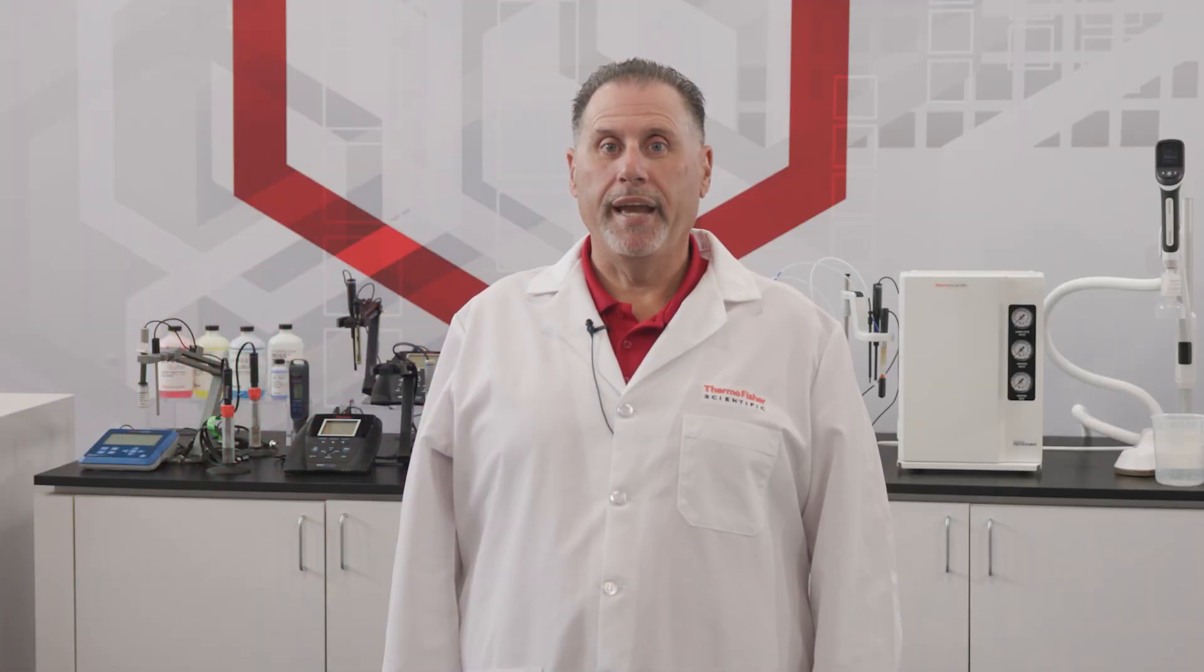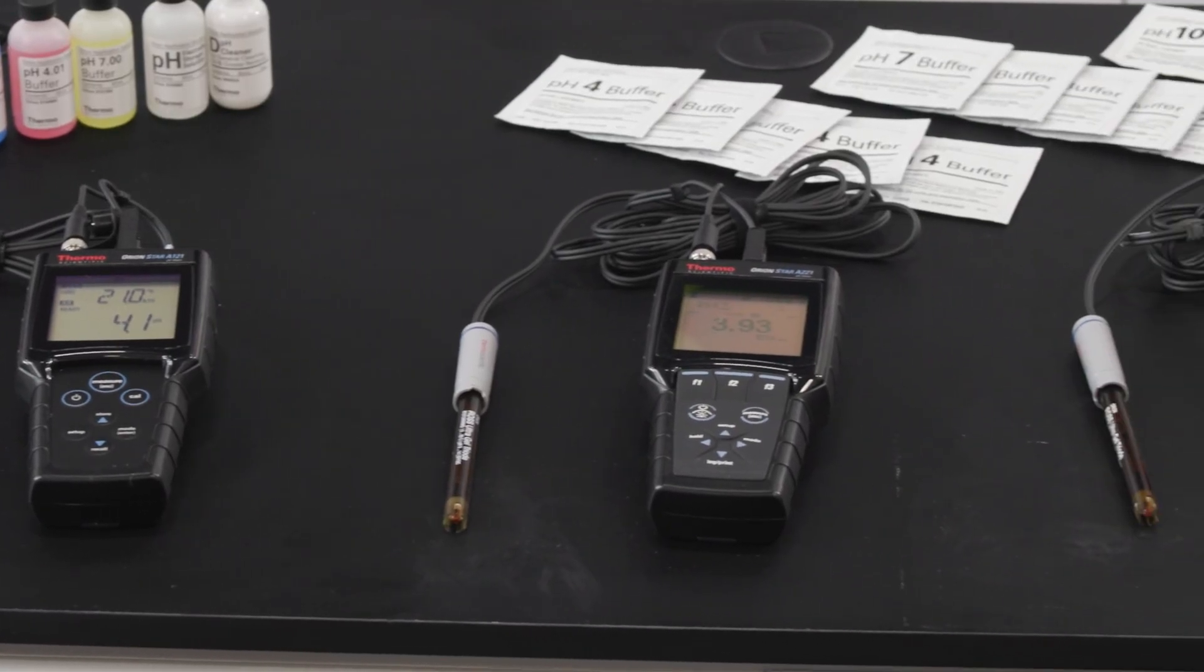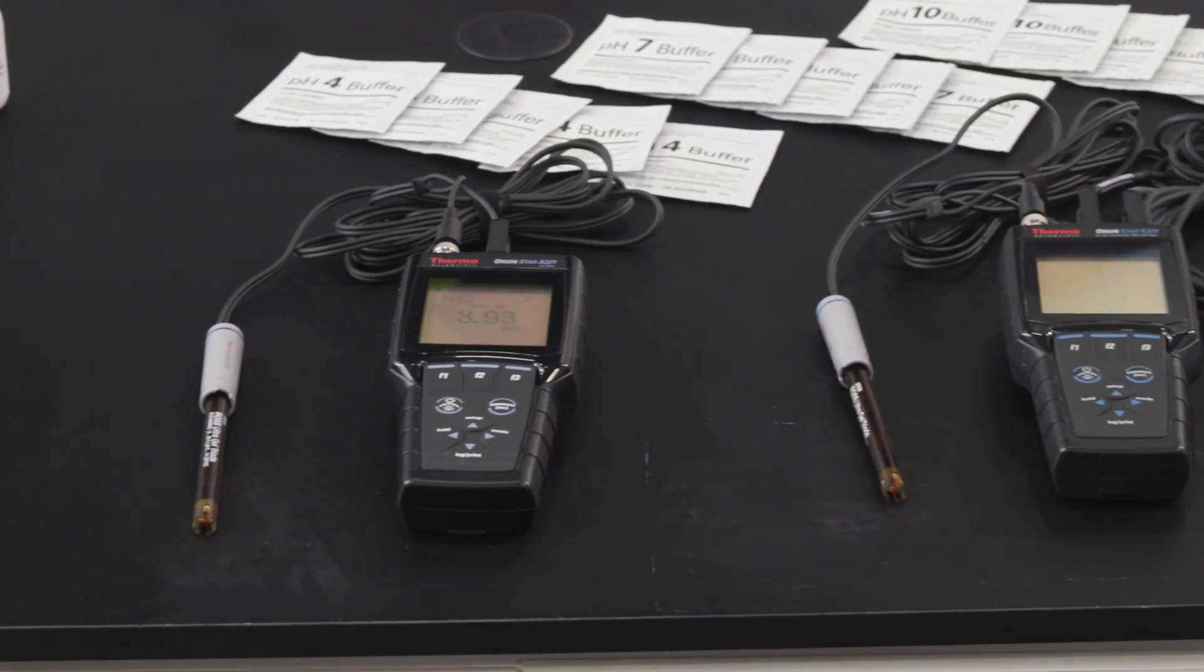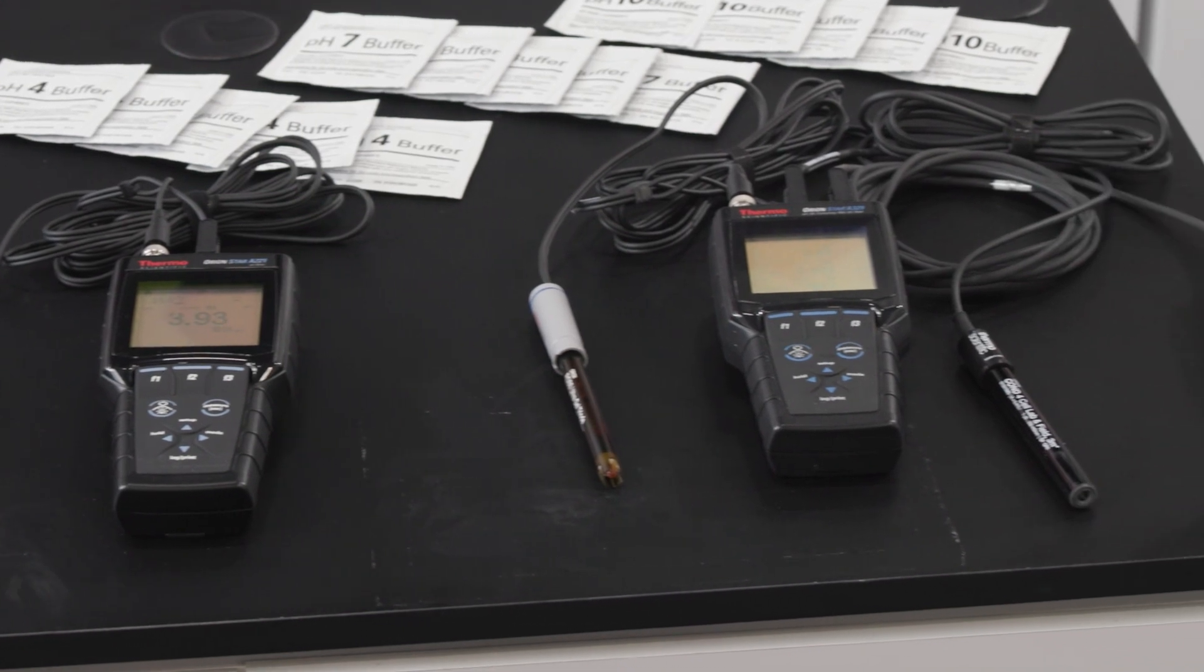When looking for a new portable pH meter, there are a wide variety of options to choose from. Whether you're a scientist, a water quality professional, or someone who just wants to monitor pH levels, selecting the right pH meter is essential.